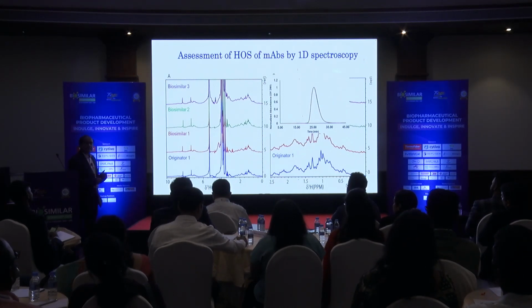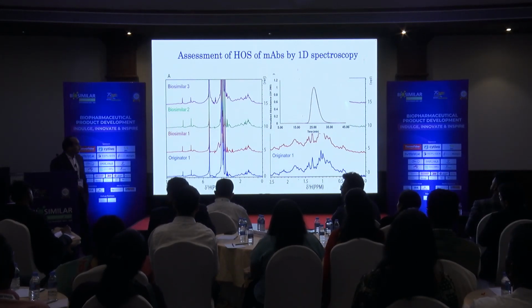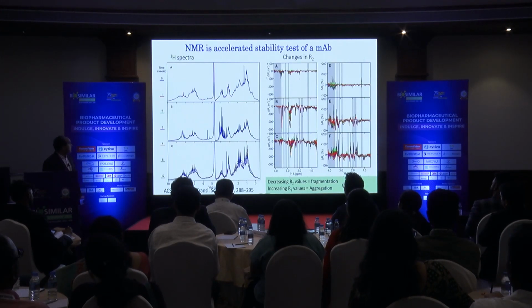the structure? So we took out the sample after the experiment and ran it on gel and SEC, and we find that all of them remain the same, and that matches the initial sample before doing the experiment. So we showed that 45 degrees does not change the structure at all, right? So we are still in the safe zone while recording this. Keep going, right?